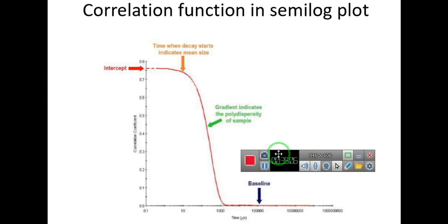please try to think a lot about what was said, try to understand why you have to compare the signal pattern with its delayed time.